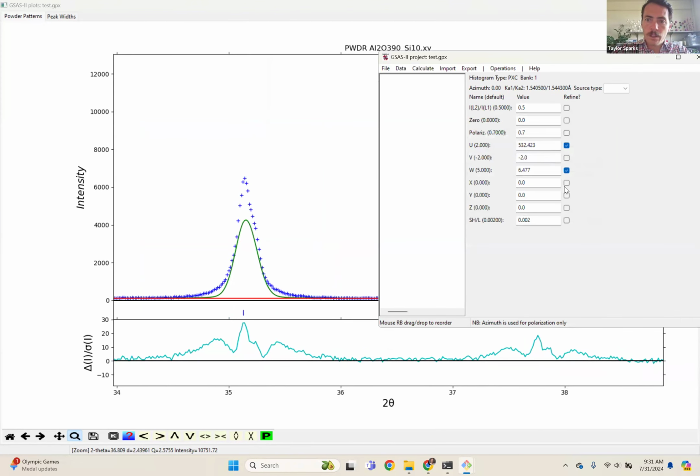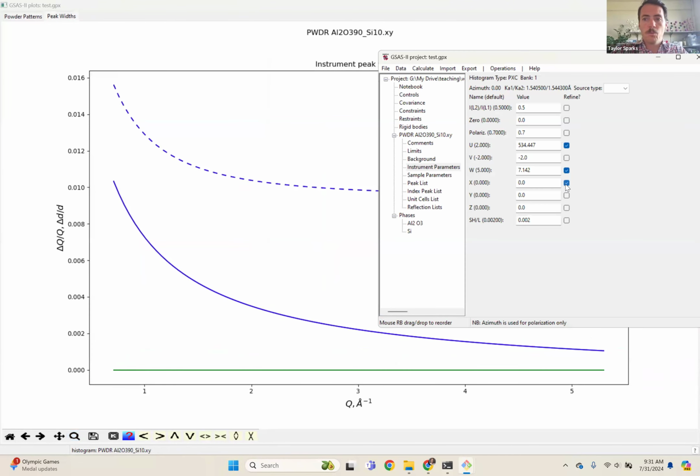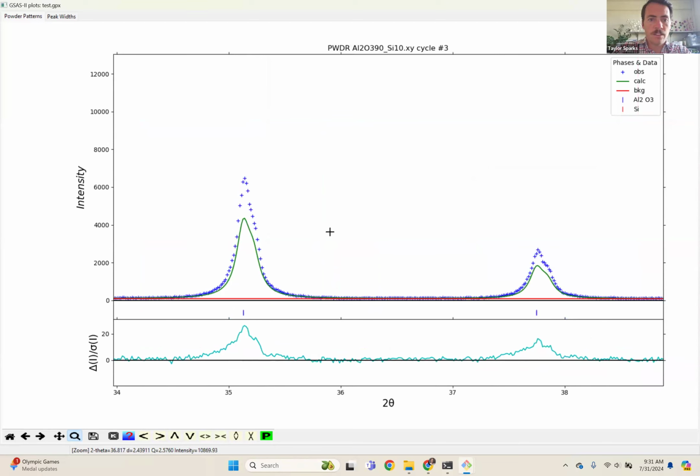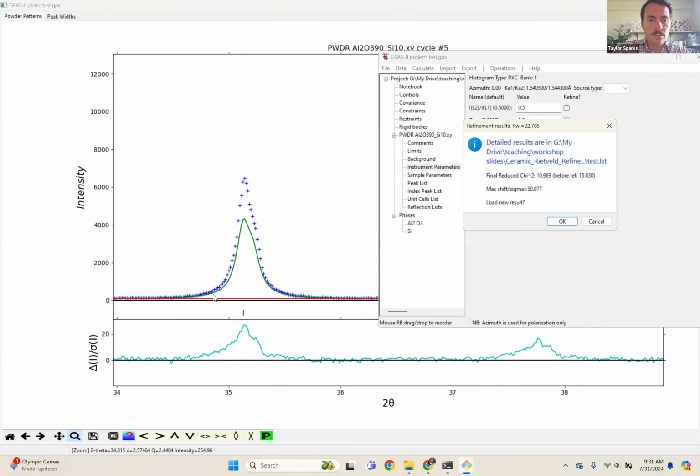No, it's not really quite getting them. So let's try turning on LX. If you want to be safe, you can turn them on one at a time. I'm going to risk it and just try all three at once. This is going to add that, see that Lorentzian shape? It really added these tails, which improves it quite a bit.